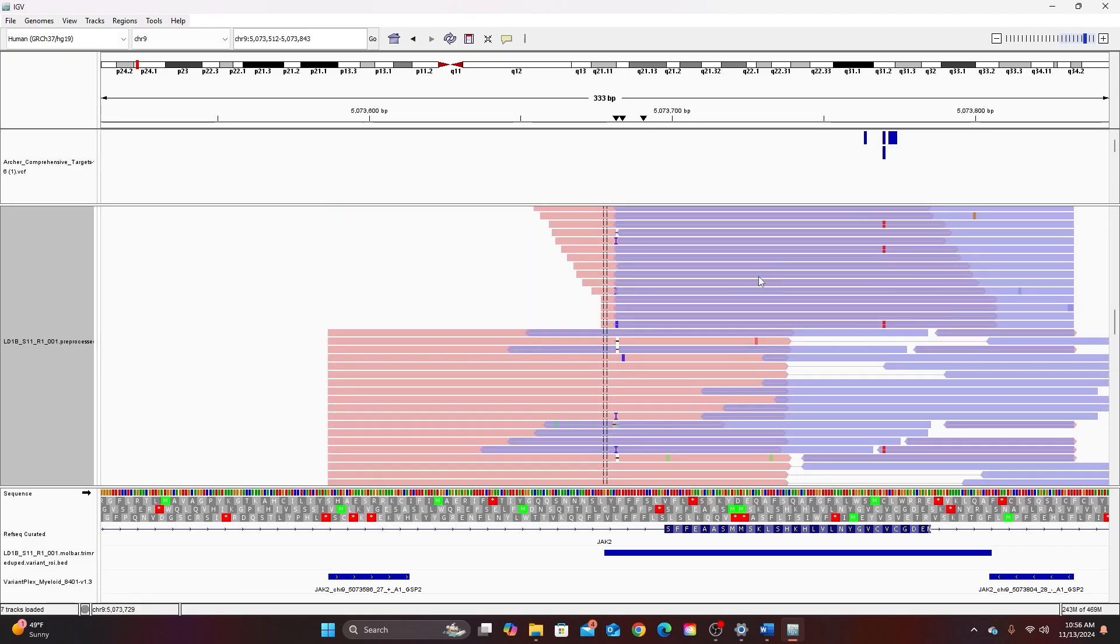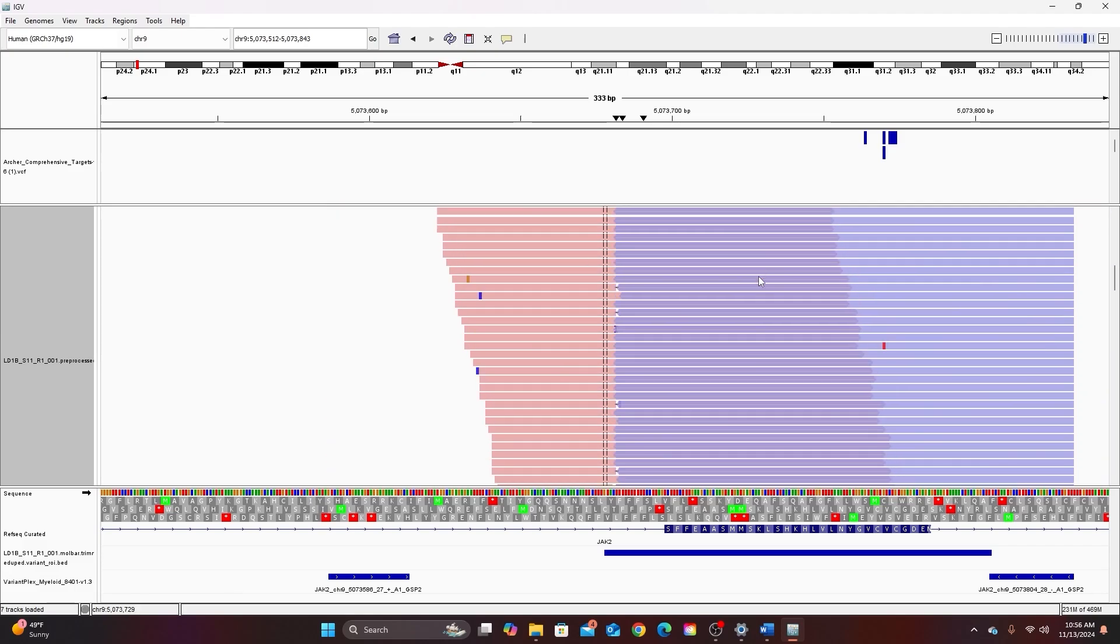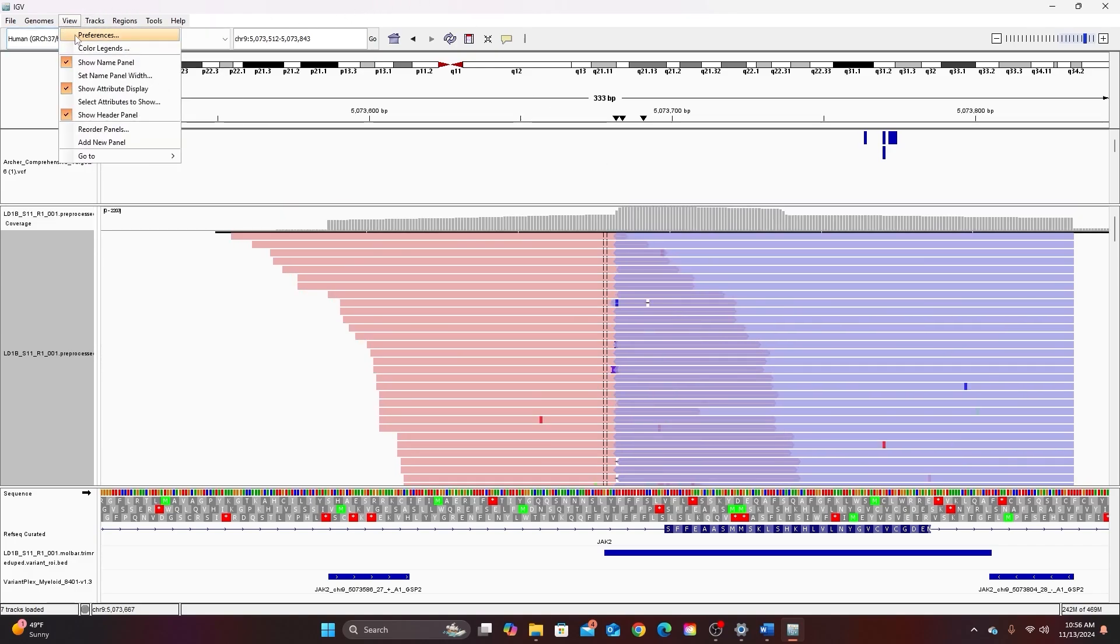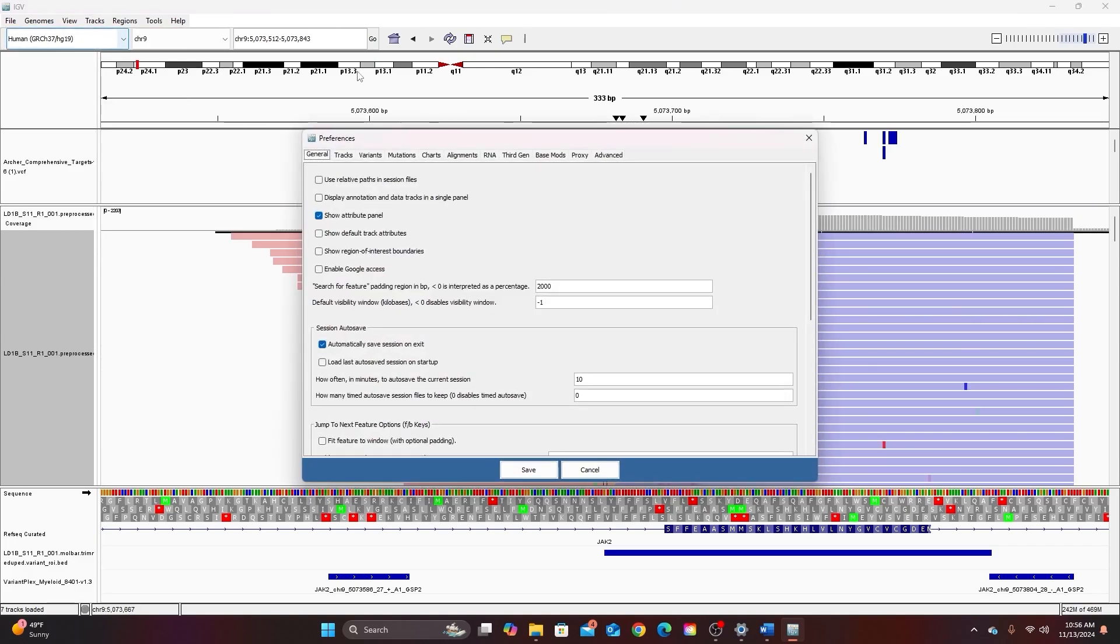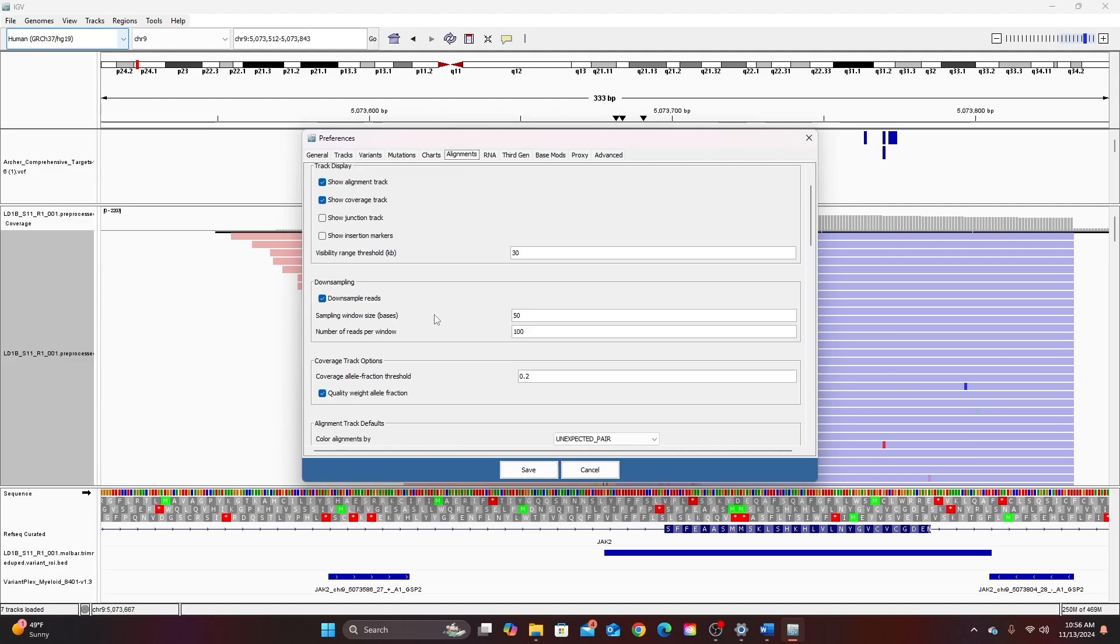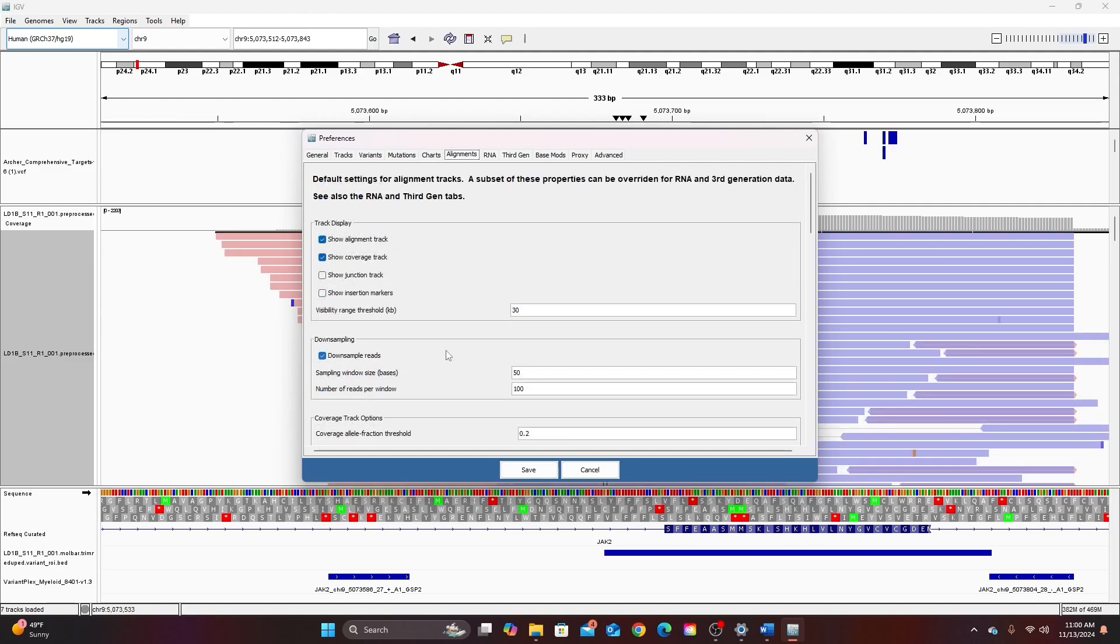Now if anything in your alignment doesn't look like mine but you would like it to you can go back to view preferences and find pretty much anything you want to change about your alignment view here in this alignment tab. If you are looking for rare variants and having trouble viewing them you may want to unclick downsample reads.